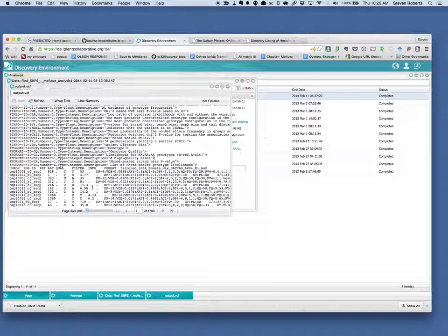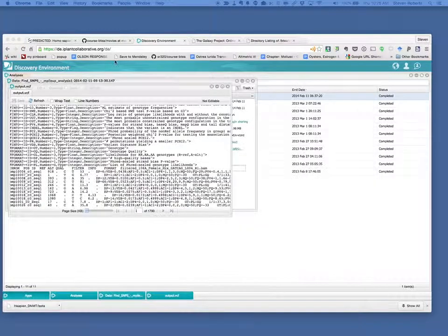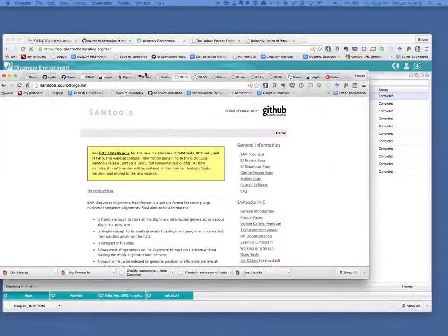These codes are for the genes, I have to look. This is the position. This is what it is in the reference, what it is in terms of the SNP. Okay. So I've showed you a couple of things there, how to do it open source, and also showing you again roughly iPlant as a tool you could use. But again, I just want to remind you that SAMtools, you could do all of this on a computer, maybe not the one you're sitting in front of now, depending on the amount of data you had.